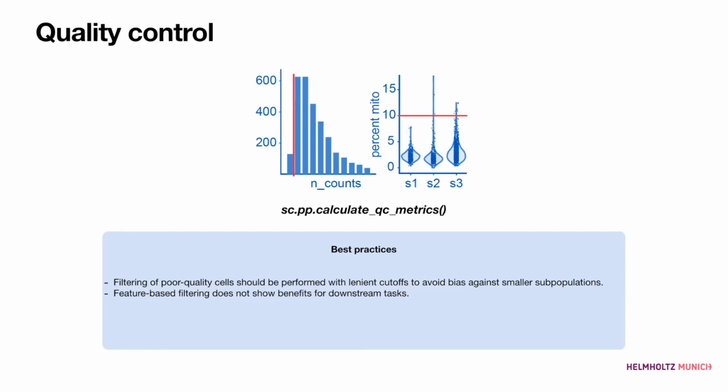I mean, I would at a first step just do the filtering, but again, I think it depends on what kind of questions you have and what you expect to be there in your data. It's very basic steps. I would do filtering thresholds.